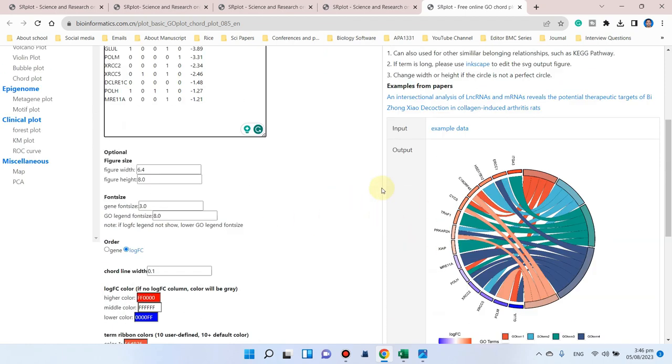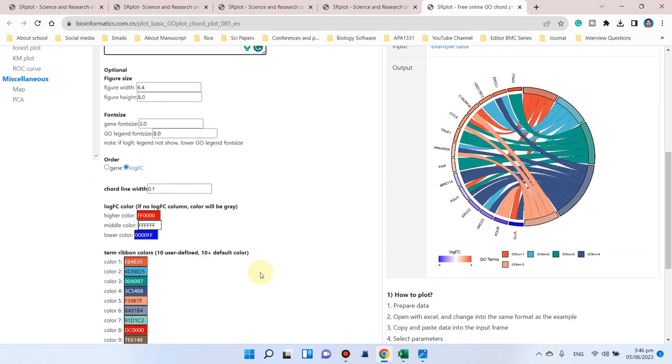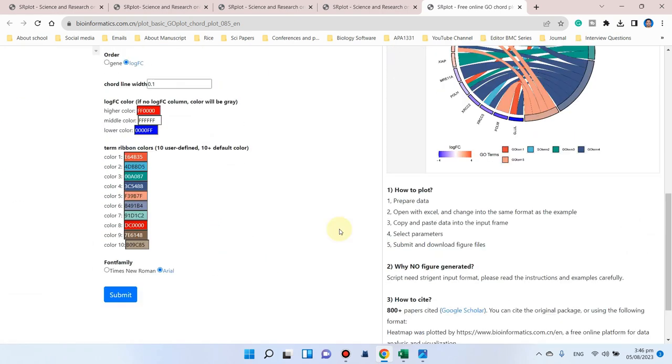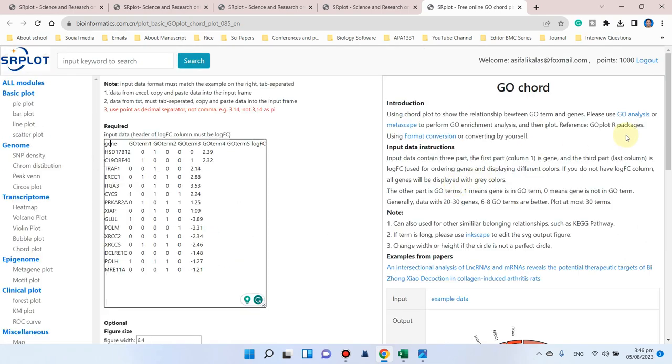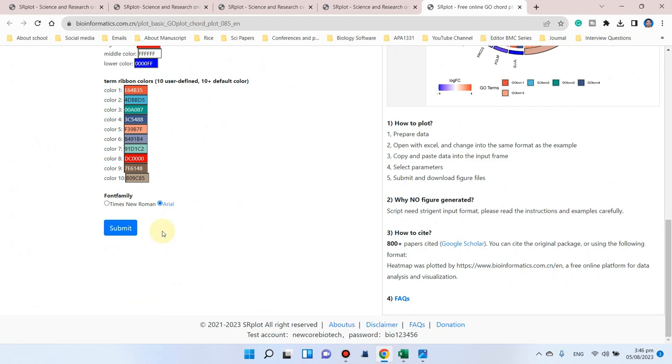This website is totally free to login and after that you can simply submit. You will see your GO chord analysis is generated.